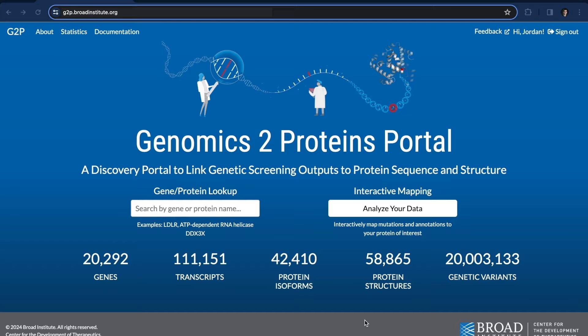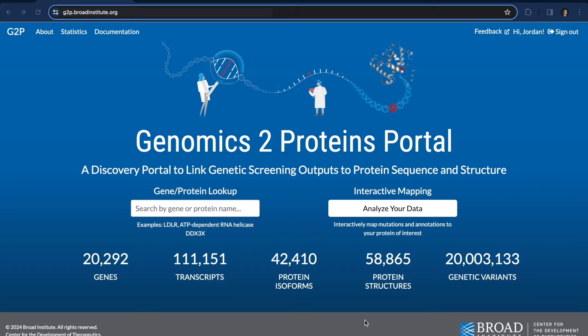G2P is Genomics to Proteins Portal, and you can use it to map genetic variants to a protein structure. I'm going to quickly go through an example today and show you how it works. We'll use G2P to generate a hypothesis, and we'll try to figure out how mutations found in a paper could be causing a disease.